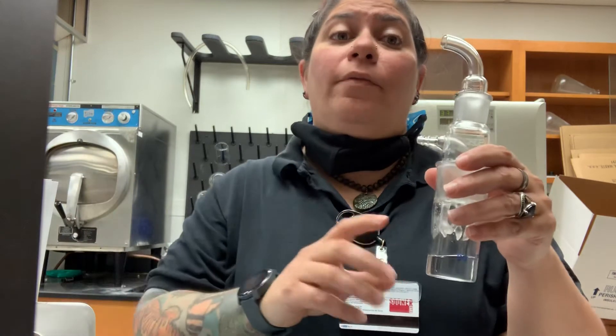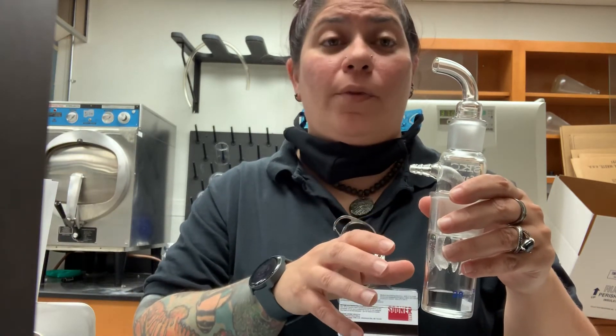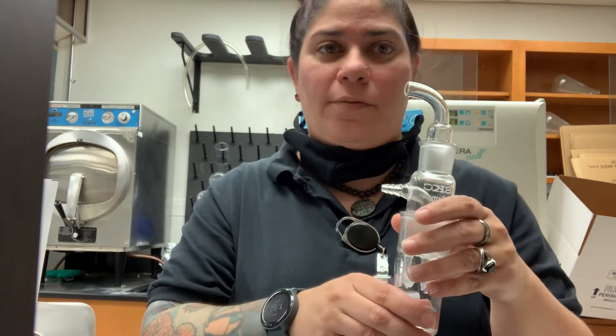Now, because this sampler is bounded at twelve and a half liters per minute, the pump can be set at thirty liters per minute; however, the sampler is still only going to be operating at a flow rate of around twelve and a half liters per minute.